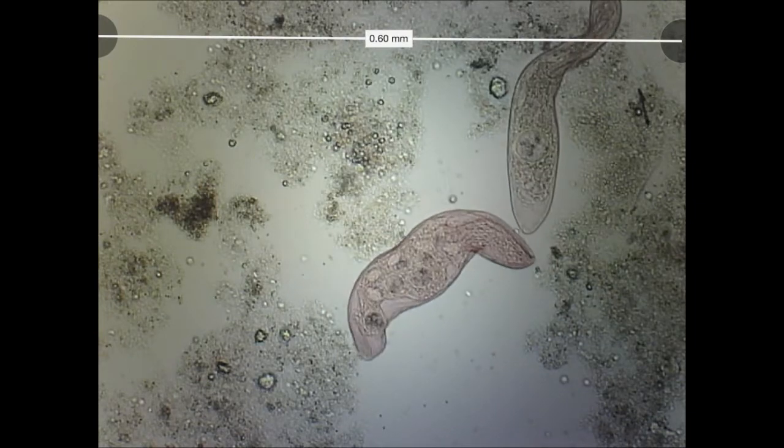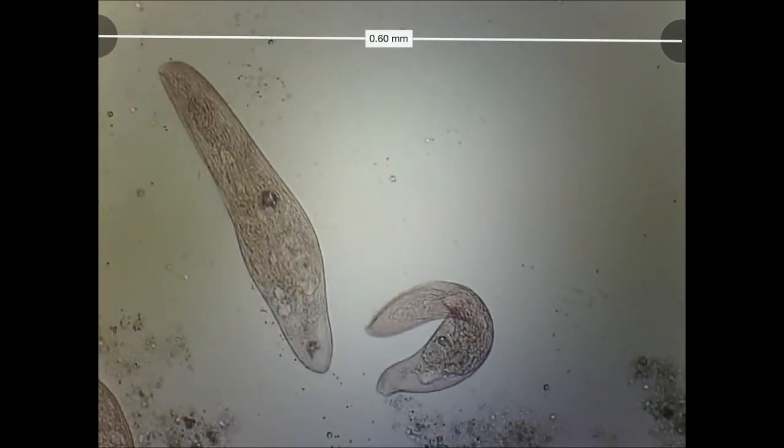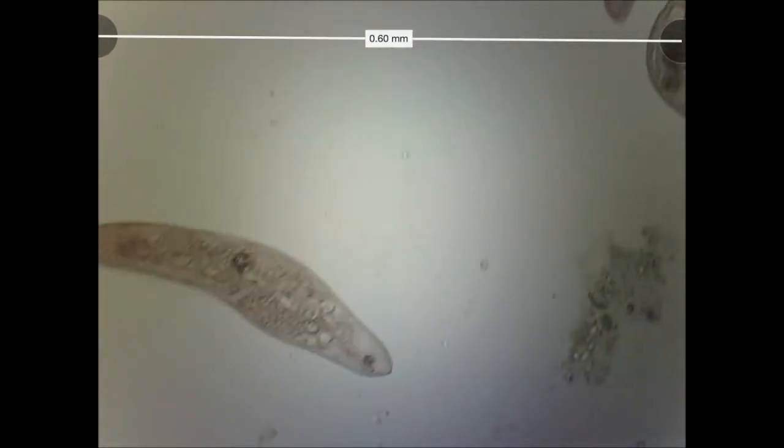These are small, maybe a little bit more than a quarter of a millimeter in length, but some of them, as you will see, get quite large.